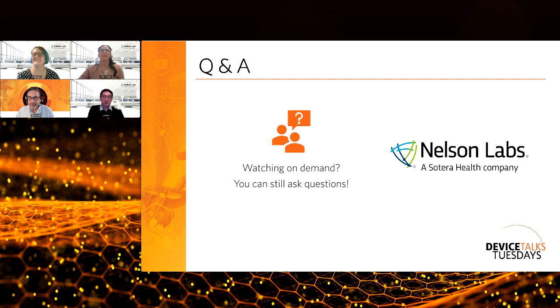All right. Question number 1 from Rob. Rob asks, do you need to age samples prior to testing? I'm not sure who to throw that to, but I'll just throw it to the group. Yeah, so that's a really good question, especially because life cycle has been emphasized more and more recently by the regulatory bodies. In general, we don't necessarily age for every test, but we have generally recommended performing cytotoxicity on an aged device versus a non-aged to have that comparison. So that's generally what I've seen or done in the past.